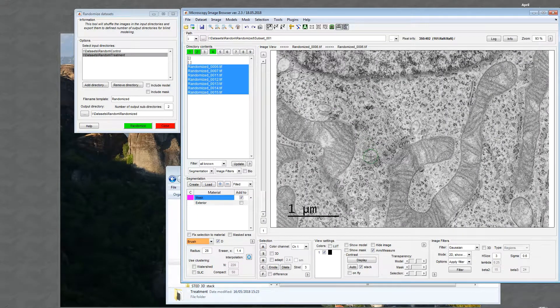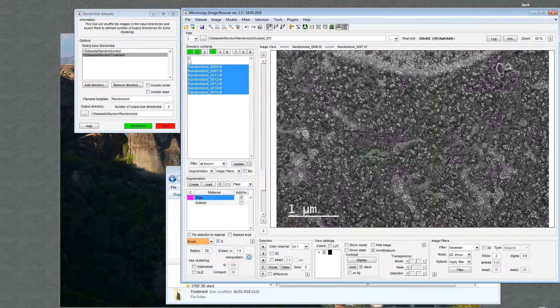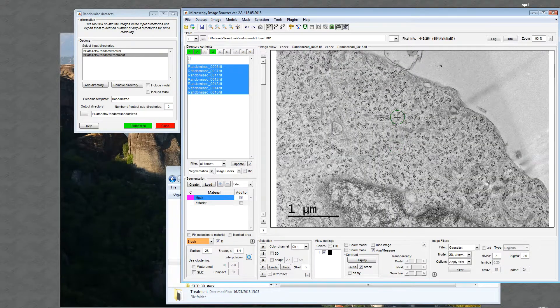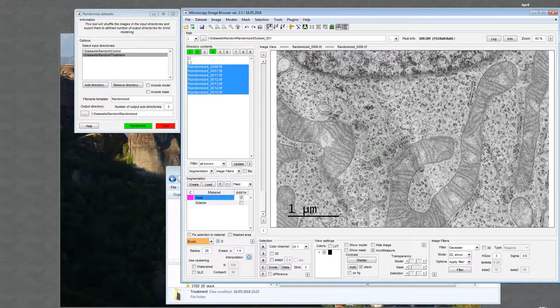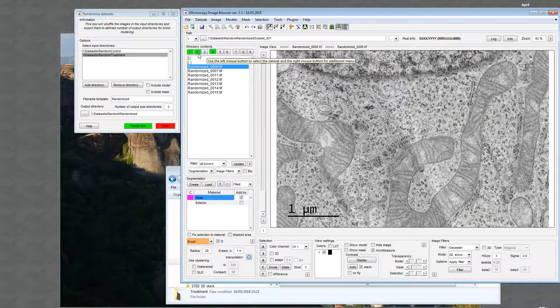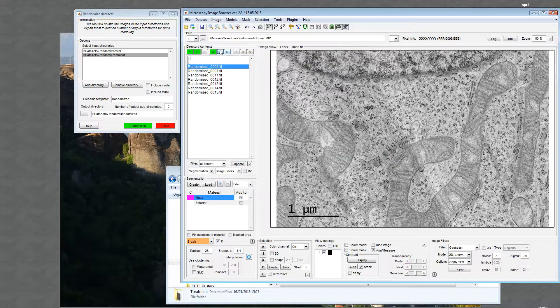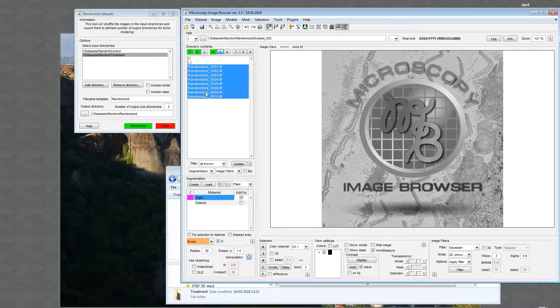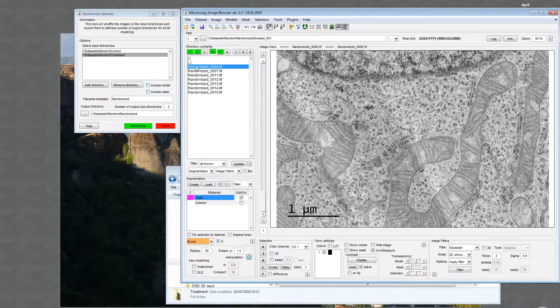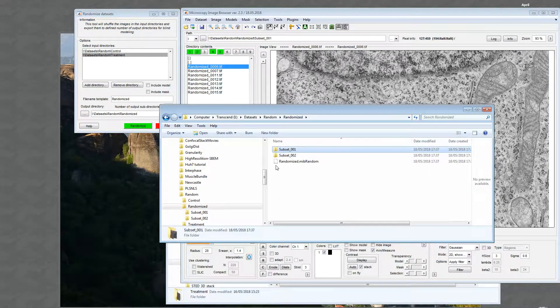As a result, a randomized folder appears. In subset one, there are files in random order — for example, the first file comes from control, the second from treatment, then treatment, control, treatment, and so on. They are also randomized within the set, so this first image corresponds to image number four in the original dataset. The same applies to subset two.